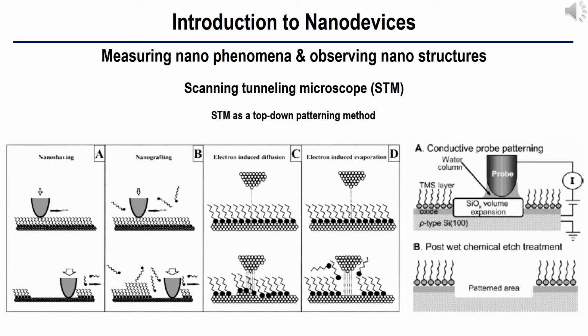Along with the atomistic imaging apparatus, STM can work as a top-down patterning technique. Due to its controllability of single molecules with an atomistic tip feature, STM can move or remove some of the molecules adsorbed on the surface as shown in the left figure. Through the tip, it is also possible to guide electrons or molecules to the underlying surface or self-assembled monolayer. Using electrons, it is also possible to oxidize or etch the underlying monolayer of molecules as shown in the right figure. These techniques precede dip pen lithography or AFM-based top-down patterning.